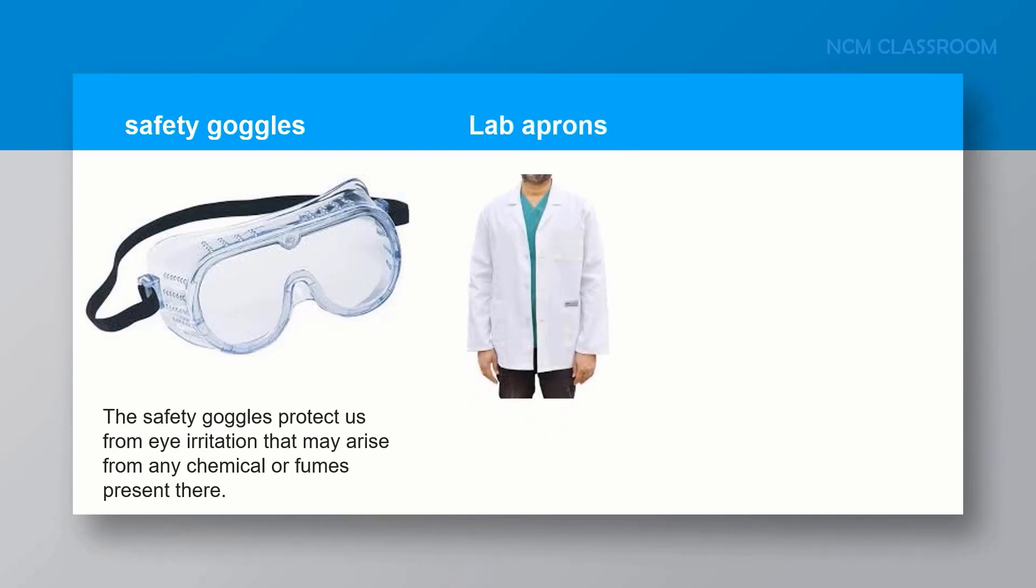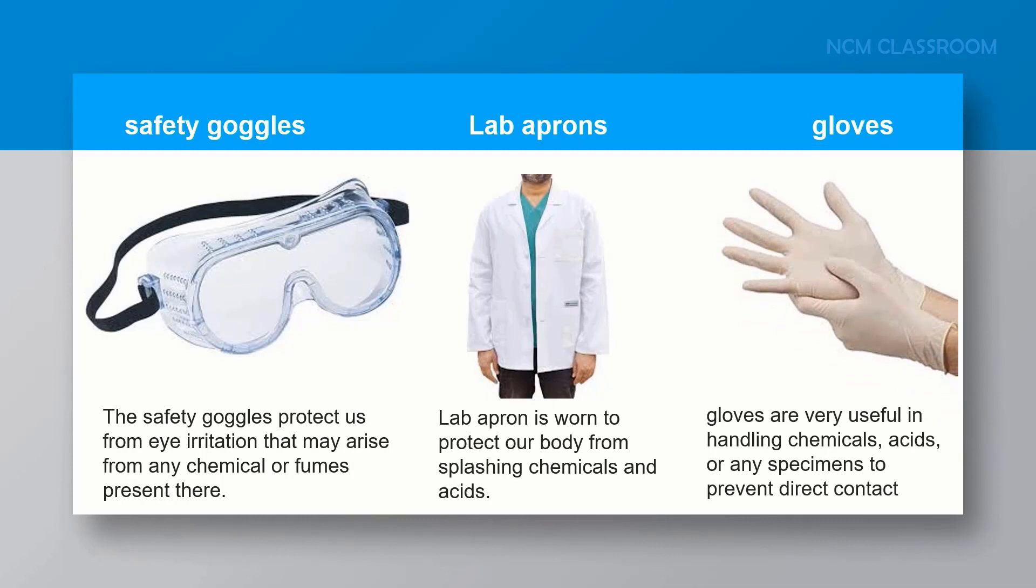Lab aprons are worn to protect our body from splashing chemicals and acids. Gloves are very useful in handling chemicals, acids, or any specimens to prevent direct contact.